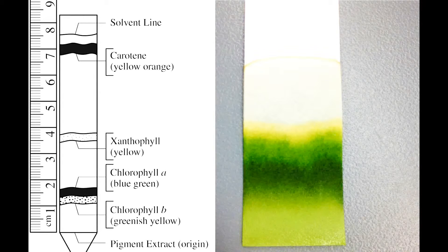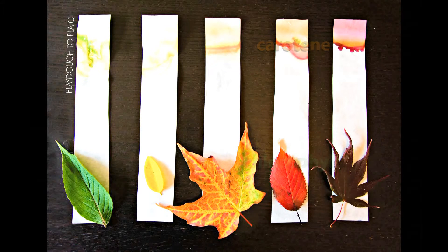Now you can take a look at the results. When it dries, you can see that the bottom will have two shades of green, which are two different types of chlorophyll. And on the top, you can see a yellow color from a carotenoid called carotene. If you chose red leaves, you can also see anthocyanins, which you can see here on this picture.